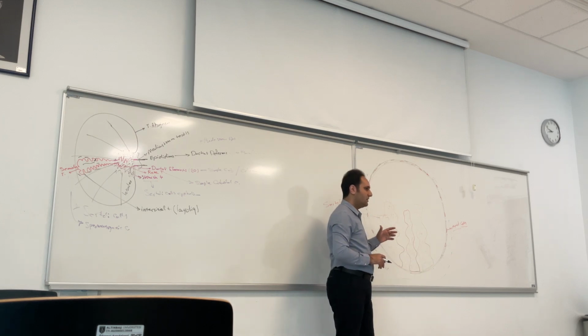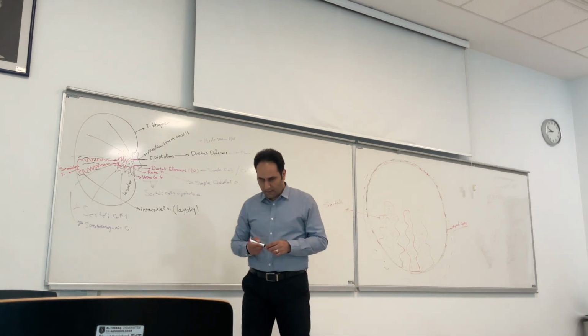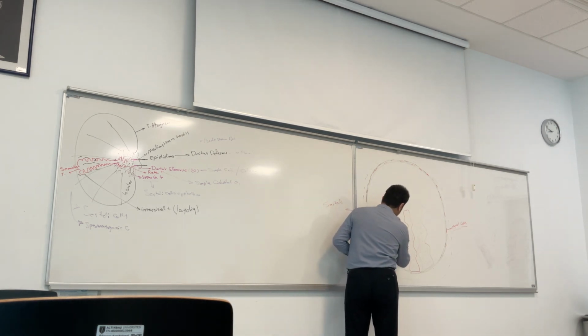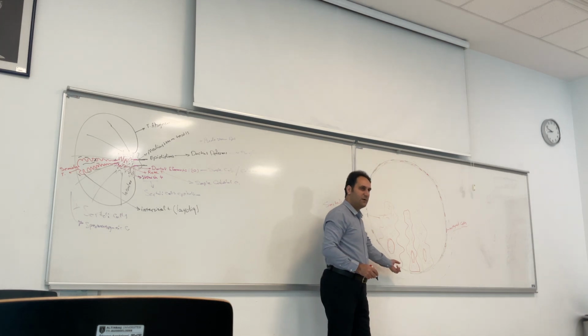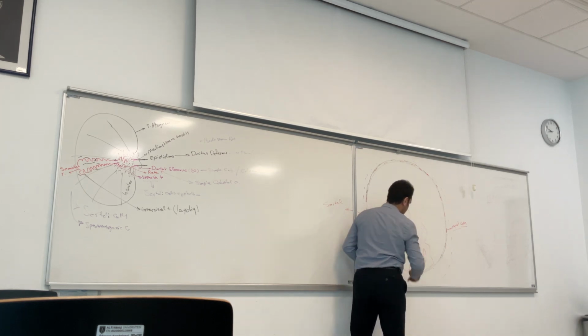But here we have some differences. In the wall of the seminiferous tubule, these Sertoli cells, which have clear or achromatic nuclei near the basement part, are connected with each other and form connections between each other.